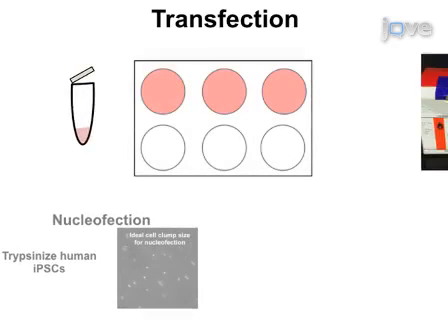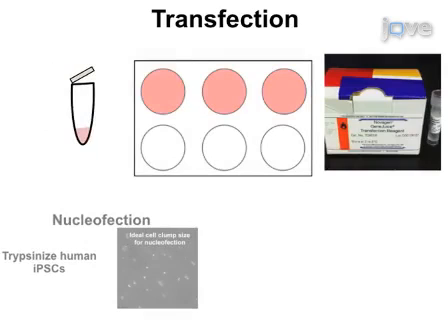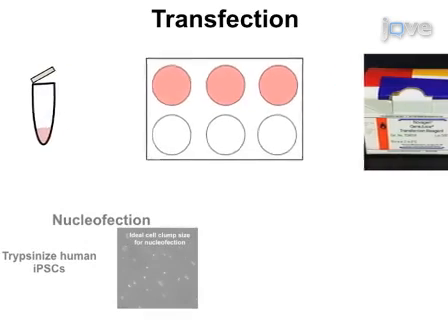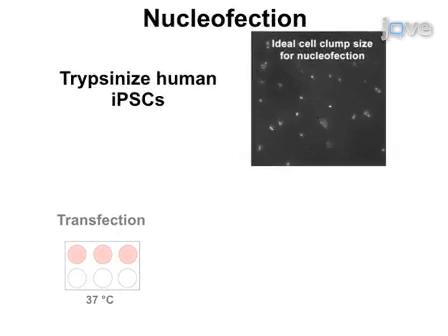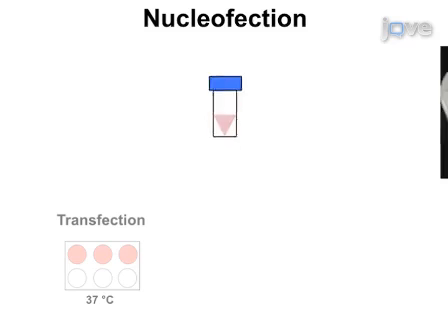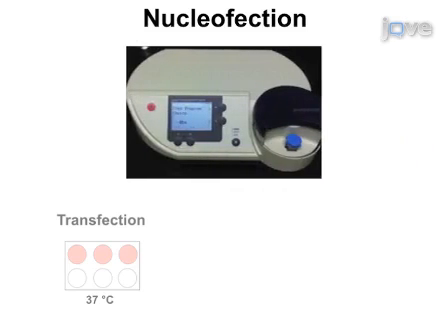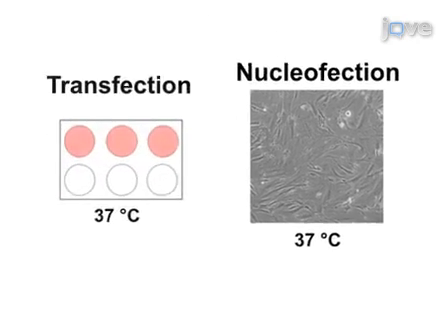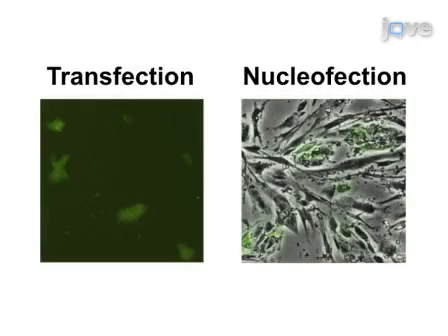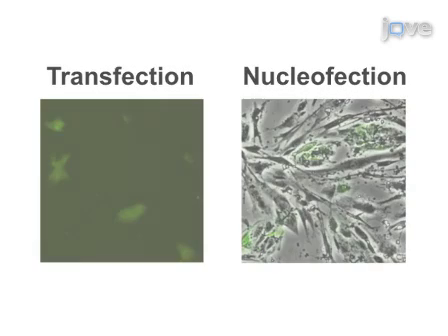A plasmid DNA and GeneJuice transfection reagent mixture is added to the plated cells, and then the plate is spun and incubated at 37 degrees Celsius. The human iPS cell suspension is nucleofected in a nucleofector device, and cells are resuspended in MEF-conditioned medium and incubated at 37 degrees Celsius. Ultimately, results can be obtained that show efficient genetic manipulation through high transfection efficiency in human iPS cells.